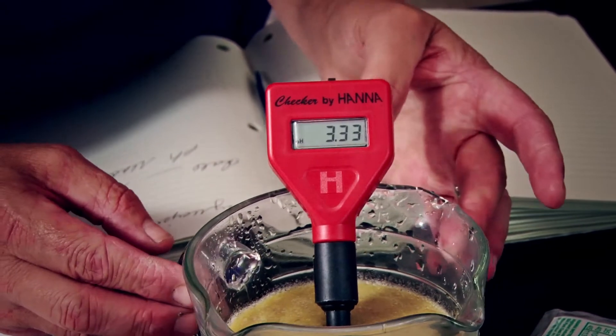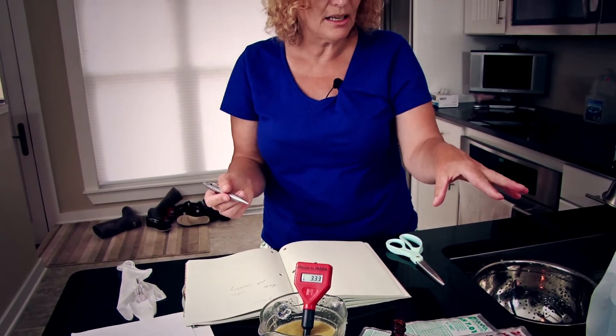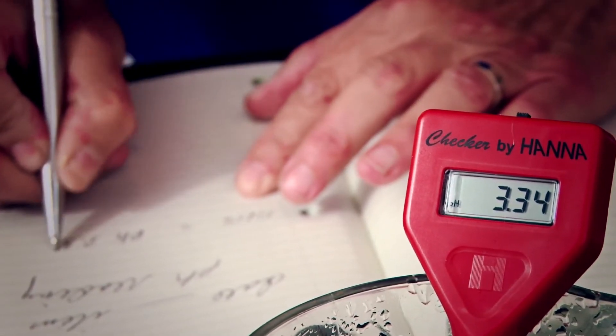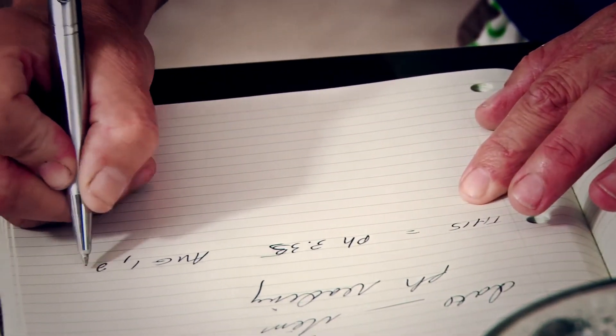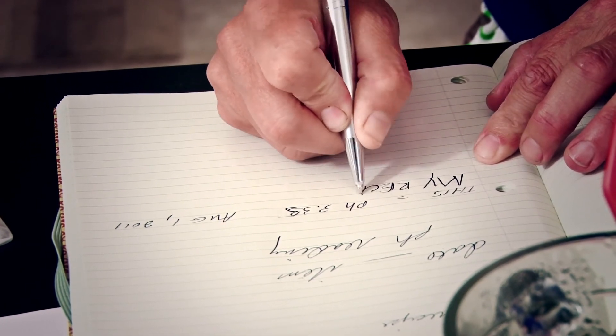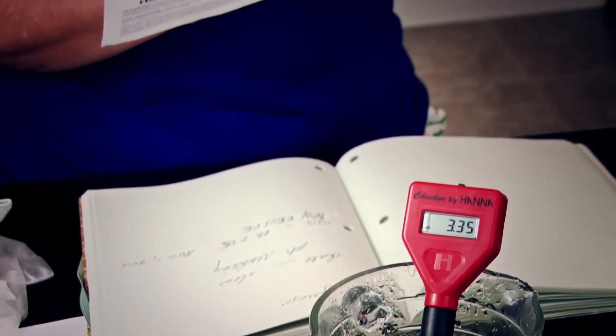This is excellent. The pH — let me write this down. You might want to kind of code your goods. We date our batches, but you might also want to give it an identifying name so you recognize which batch. This equals a pH of 3.35 on August 1st, 2011. And underneath that you want to put your recipe. According to the fact sheet given to us by the State Department of Health, if my pH value is 4.6 or lower, then this would be a safe product to sell at your local farmer's market. That's really good news.